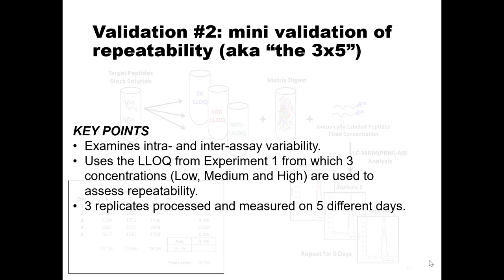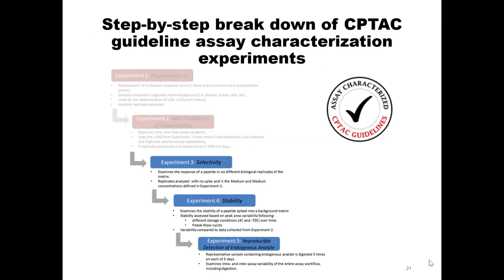These are like low QC. Exactly. If you come from a regulated environment, you might know this as low, mid, and high QC. Are there any other questions on this specific type of experiment? No?